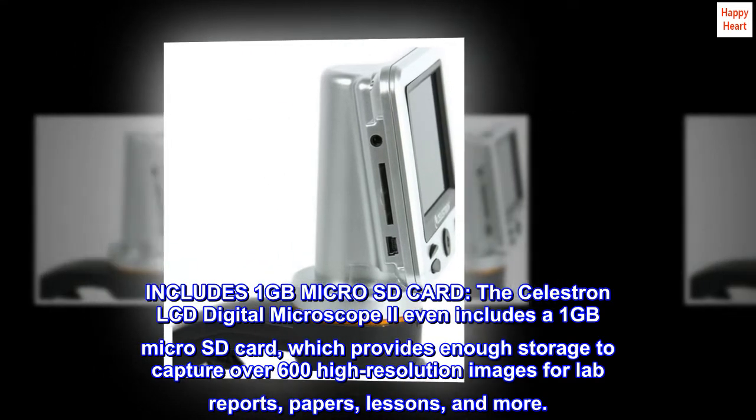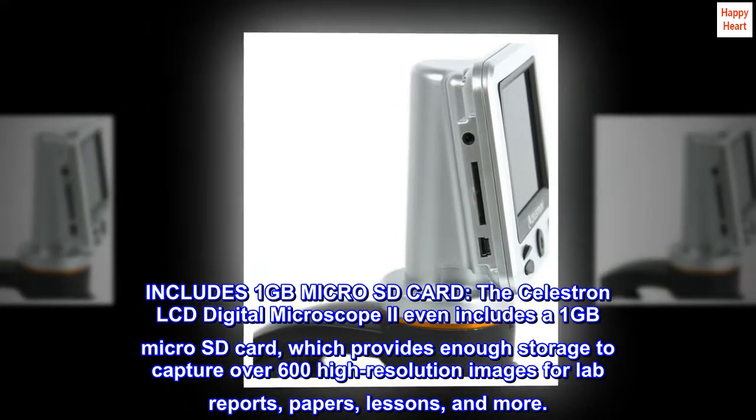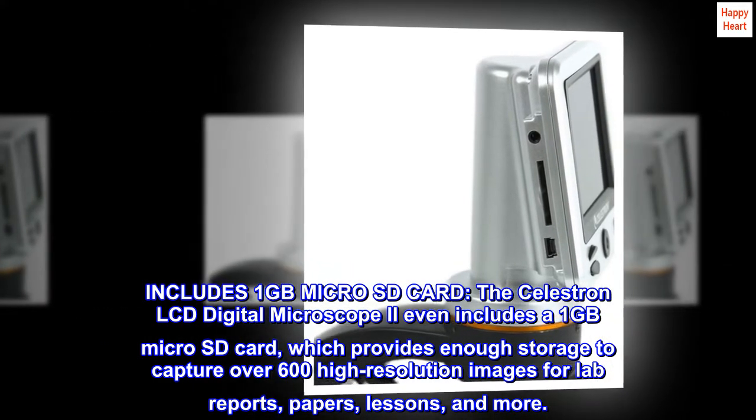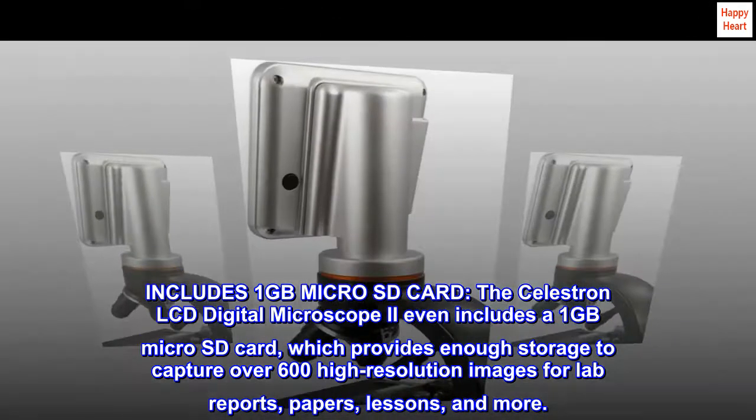The Celestron LCD Digital Microscope 2 includes a 1GB microSD card, which provides enough storage to capture over 600 high-resolution images for lab reports, papers, lessons, and more.